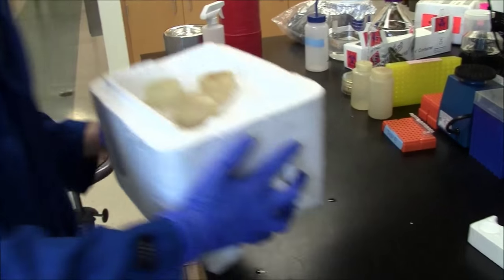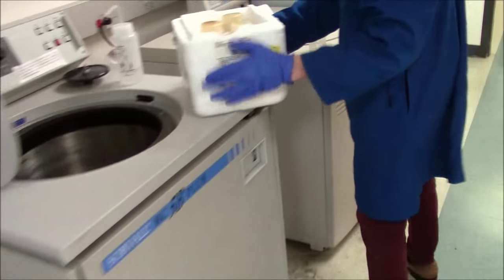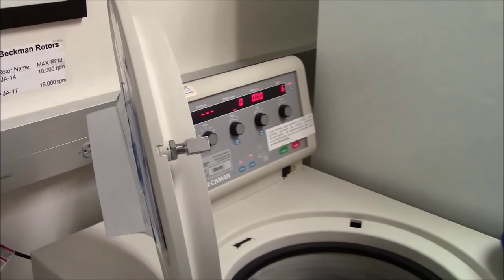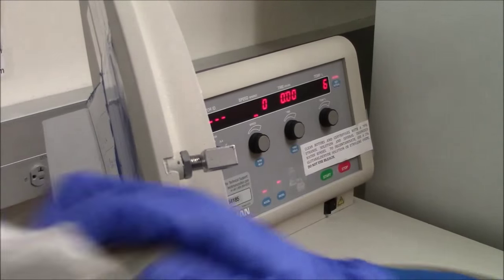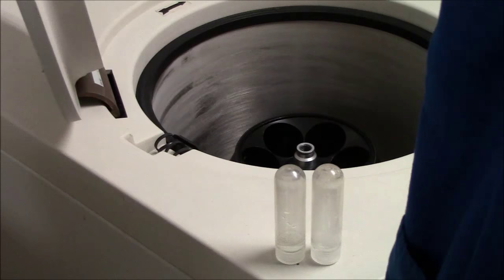These bottles have been sitting for an hour on ice, so they're ready to spin again to collect the phage precipitate. This will be a longer spin, but the rotor should be pre-chilled. Notice that it's at 6 degrees. Set your centrifuge for 4 degrees C so that the rotor is cold and the precipitate will be collected.